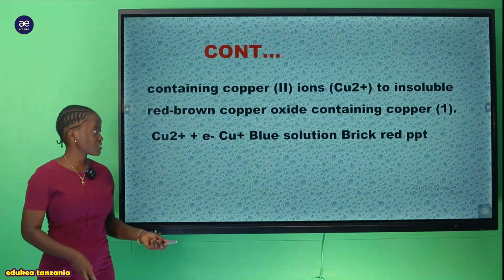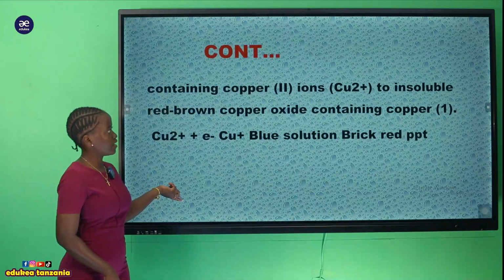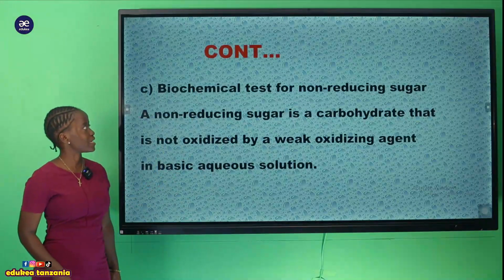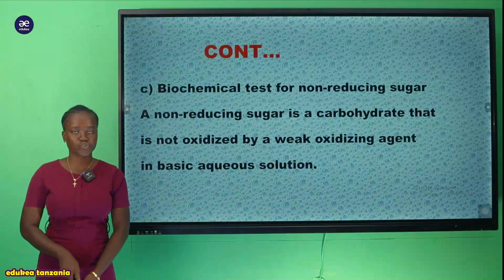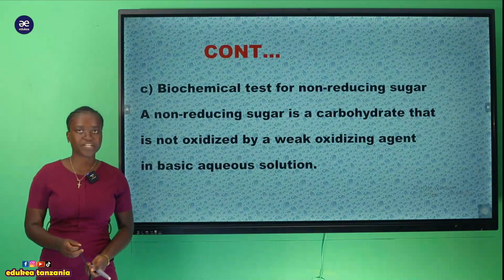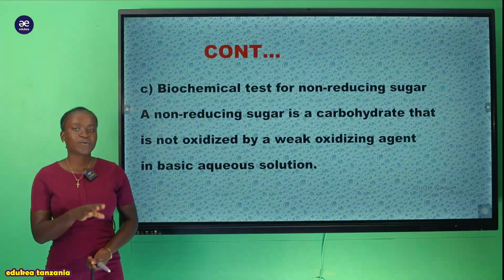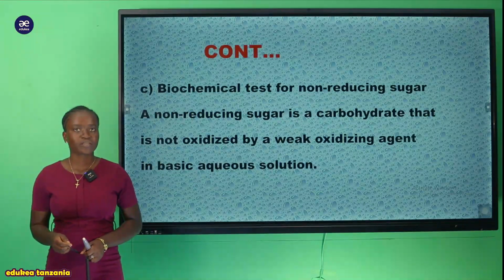So now let's proceed to look at another thing, that is the biochemical test for non-reducing sugar. So now let's see this biochemical test for non-reducing sugar. How is this biochemical test for non-reducing sugar done?